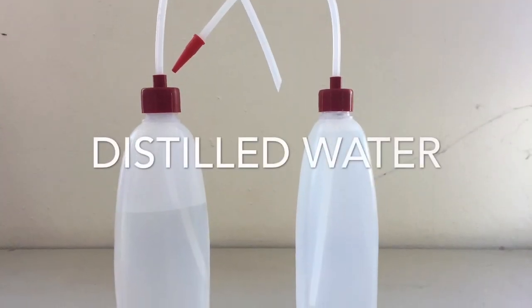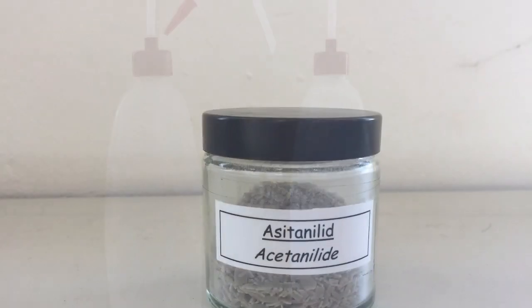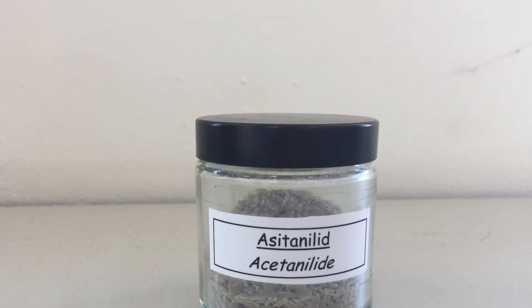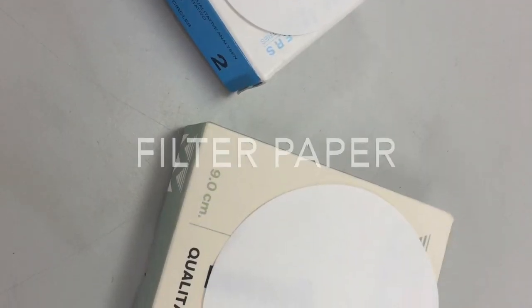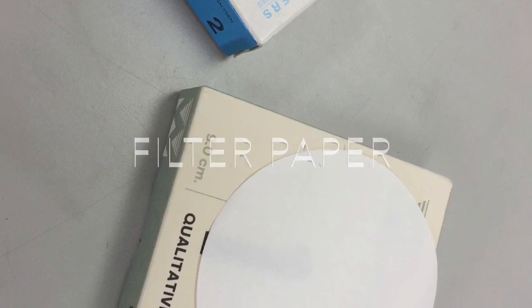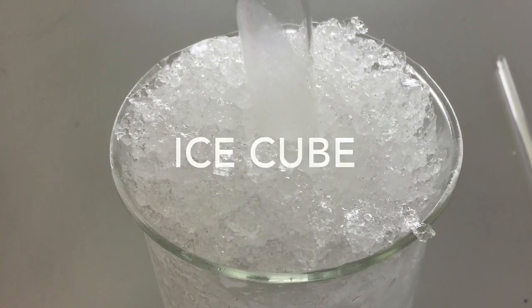The first material is distilled water, chemical substance acetanilide, filter paper, and ice cube.